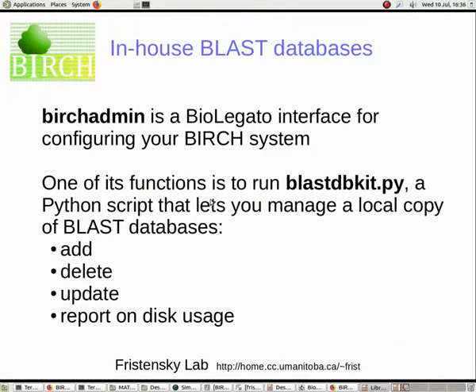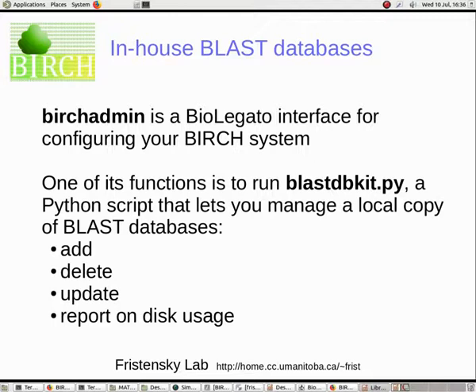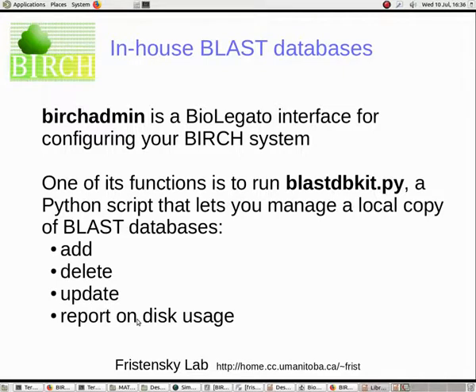The last topic I want to talk about is creating your own in-house BLAST databases. We've already seen how BioLegato can run BLAST searches on local copies of a BLAST database. Now, I want to show how easy it is to manage and install these databases using the BLASTDB kit Python script. You can add, delete, update databases, and get reports on disk usage, all from a single set of BioLegato tools.